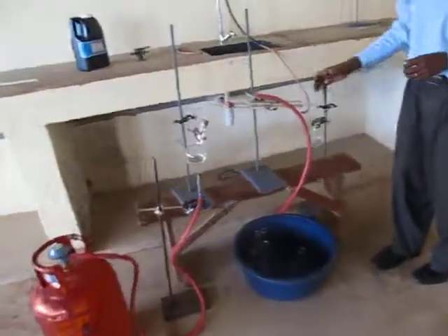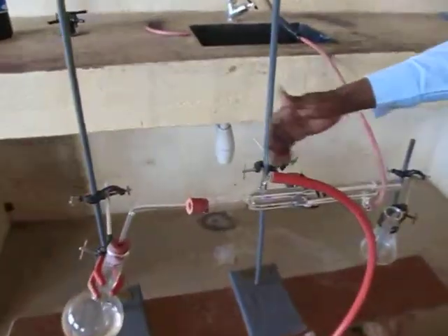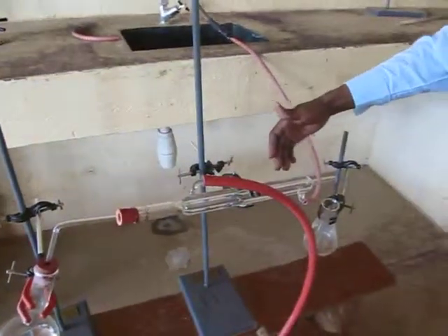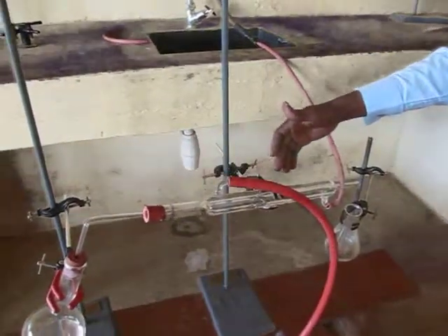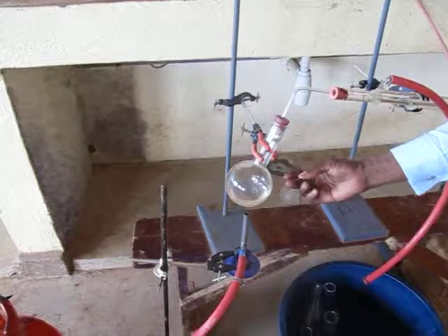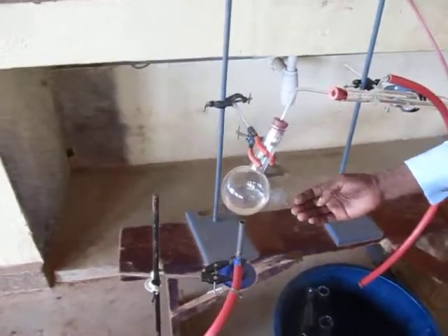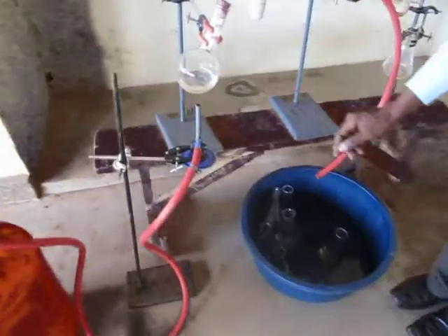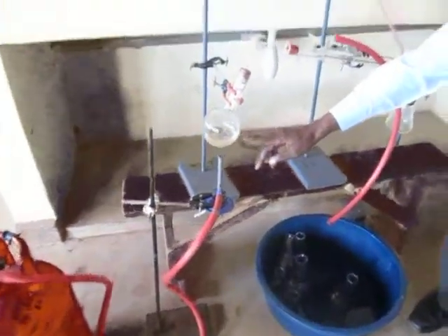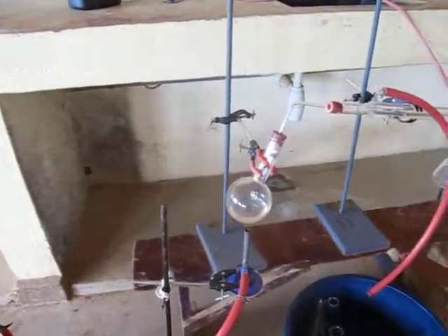The most important component is the Liebig condenser. This is actually where condensation takes place. It's connected to a round bottom flask where we are putting the mixture to be separated. So inside here, we have a mixture of ethanol and water, and you can see they mix to form a uniform layer.